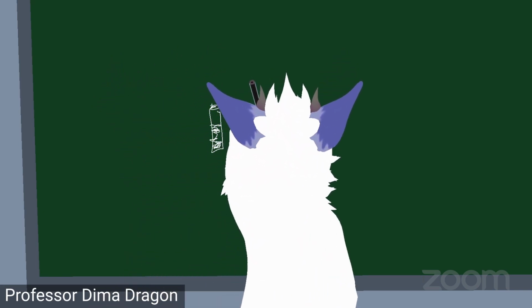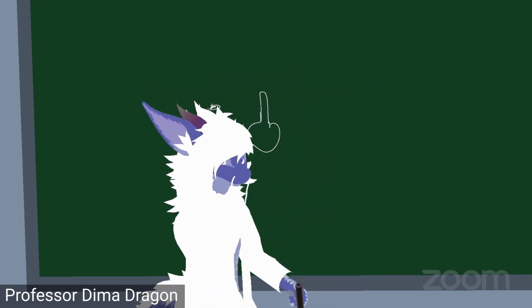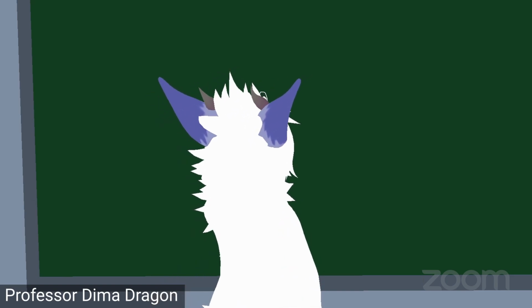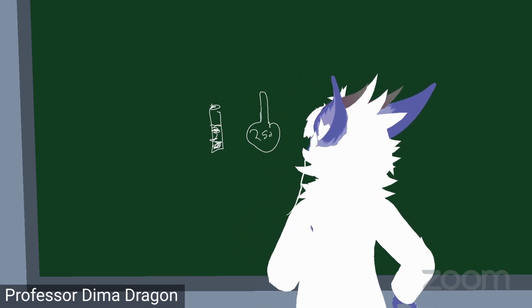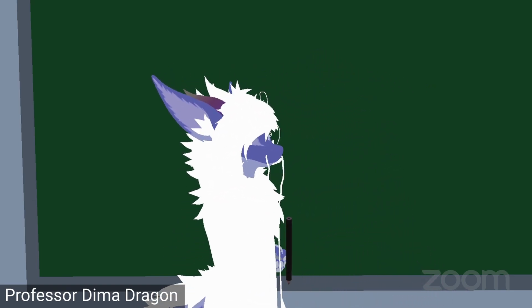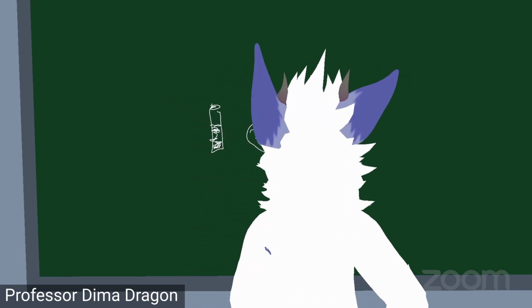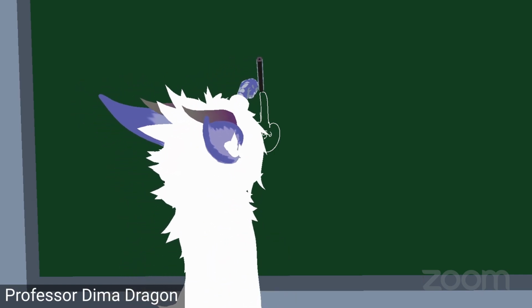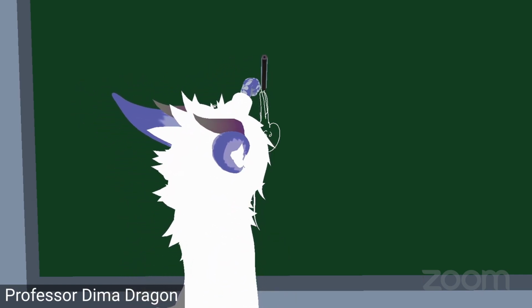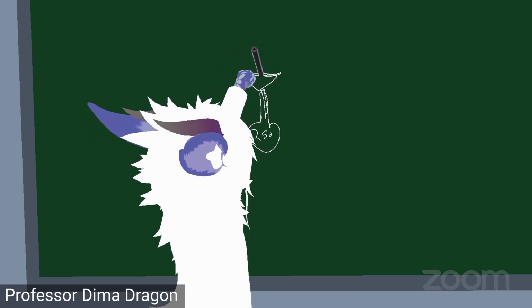So you're going to set up a volumetric flask. It's going to be, oh God, it doesn't look that bad. Okay. It's going to be a 250. Sorry about that, guys. Okay. You're going to take this, and then put in a funnel. And you're going to make sure that you have filter paper in it.